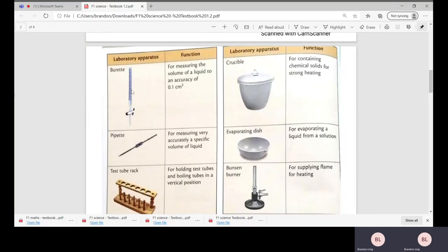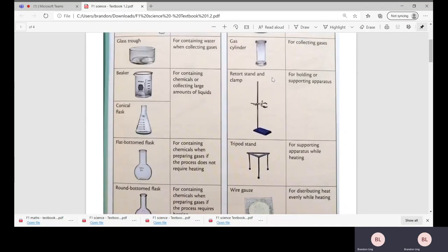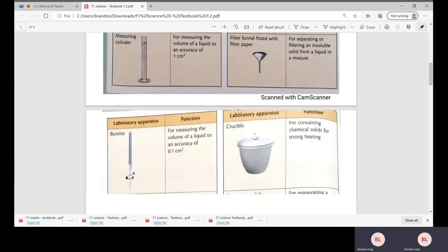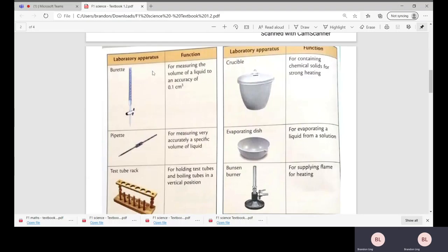Next page we have the burette. Burette is to be held on the retort stand here for an extended period of experiment, for measuring the volume of a liquid to an accuracy of 0.1 cm³. And you have the crucible, which is usually for heating purposes.